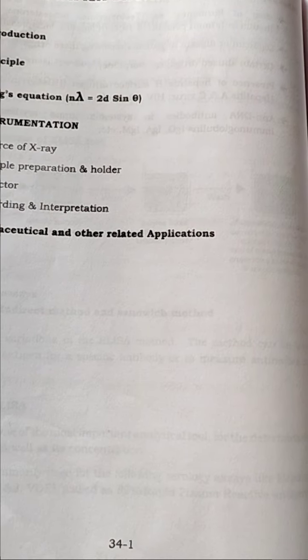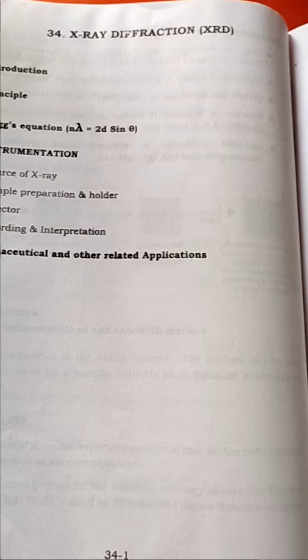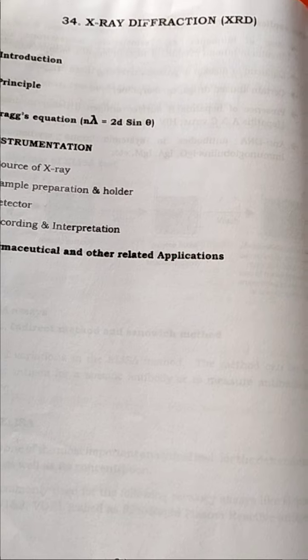In pharmaceutical analysis, X-ray diffraction is used for the structure elucidation of organic and inorganic compounds. The X-rays are passed on a crystal. If we place a crystal, then X-rays will pass onto that particle. The X-rays are scattered by the atoms.